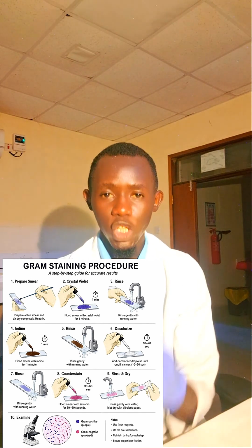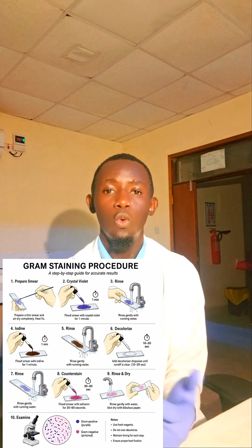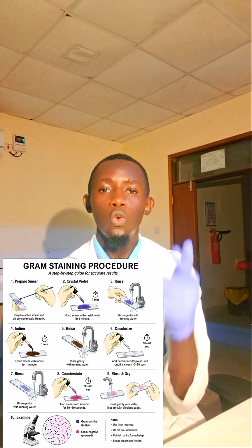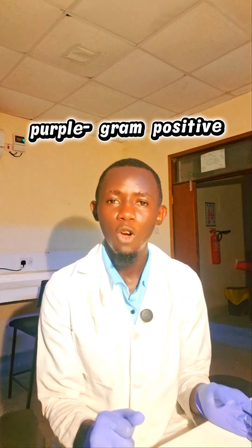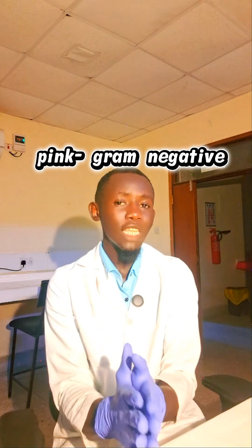Then you wash your slide. After that, what you do? You let the slide air dry. Then you will observe what? The color change. Of course, we have two things. Either it is pink or it is purple. Purple for gram positive. Pink for what? Gram negative. After that, you'll get to differentiate the different morphological structures of these cells.